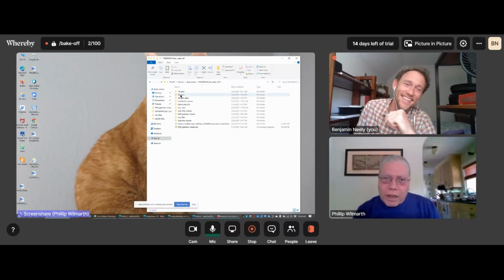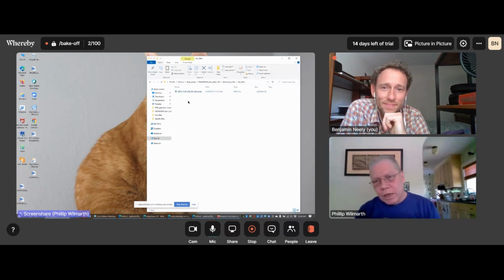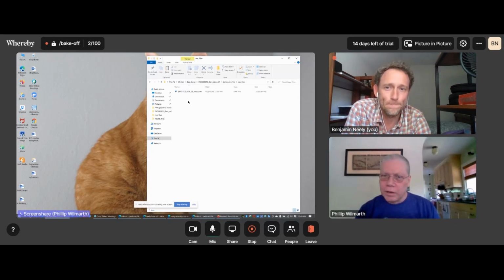Let's see. So I've got a folder here where I just have one raw file because the conversion steps and the Comet search steps take quite a while on this data set. So we're not going to have time to look at all of those, but I'm just going to pick one file here to show you how these scripts run for that. And then we'll finish up with some analysis that's got all of the 19 files. Okay, so that's what's in this special folder.